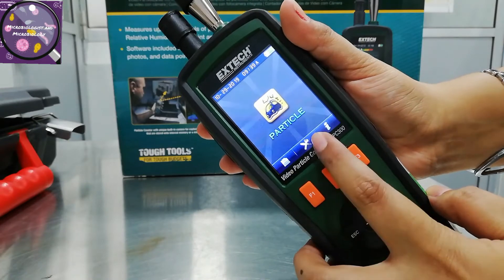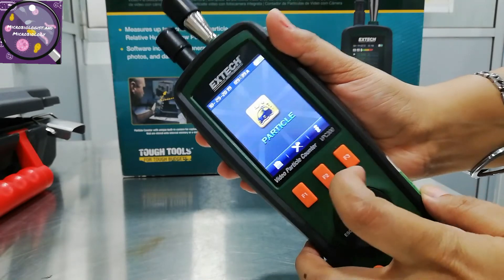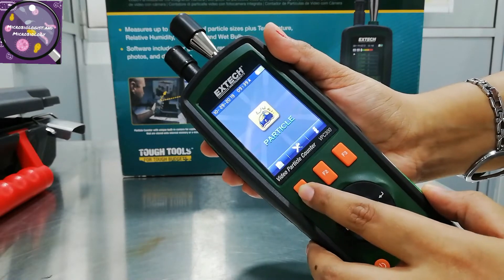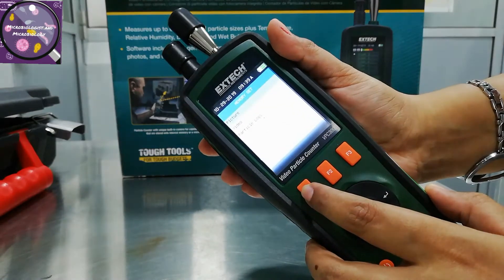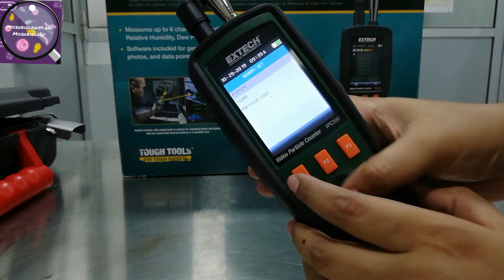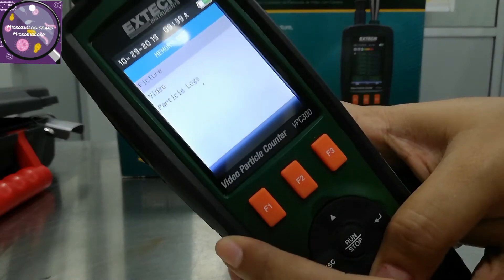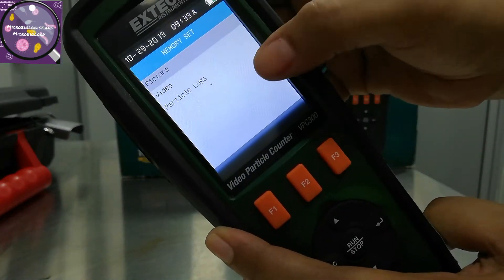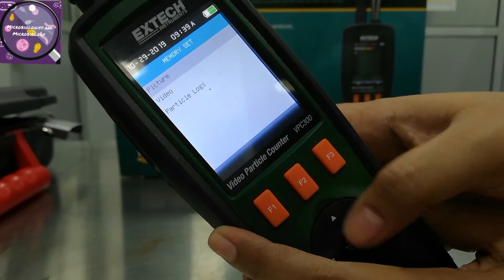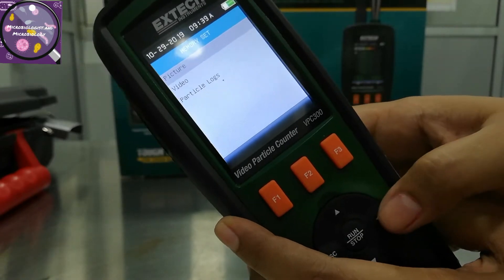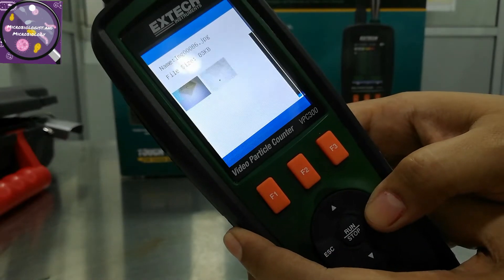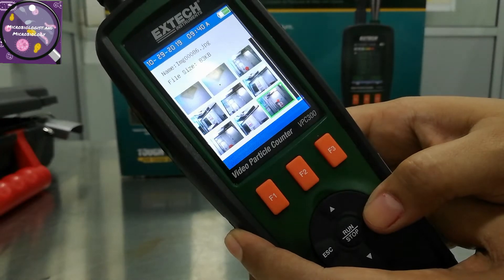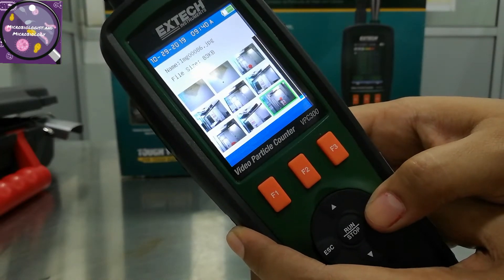I want to show you the functional keys: F1, F2, and F3. F1 is actually the memory set, in which you can see pictures, video, and particle logs. I am pressing the enter key, and here are the pictures of some locations where I have taken the particle count.